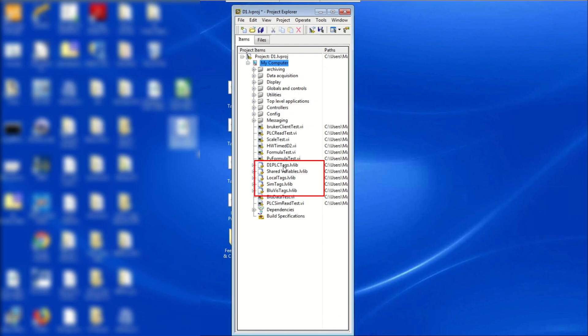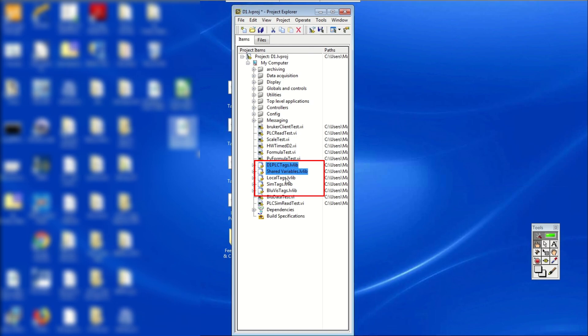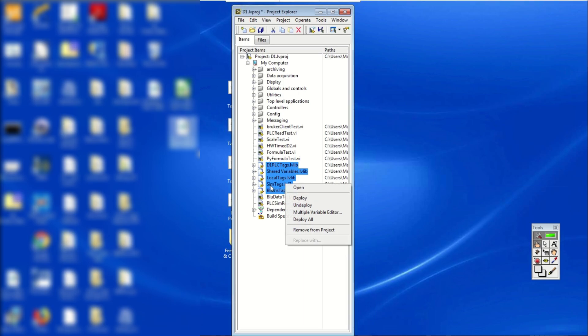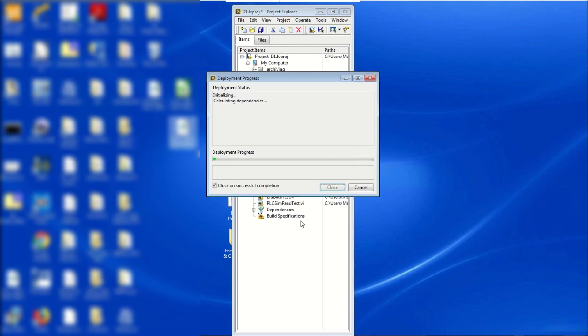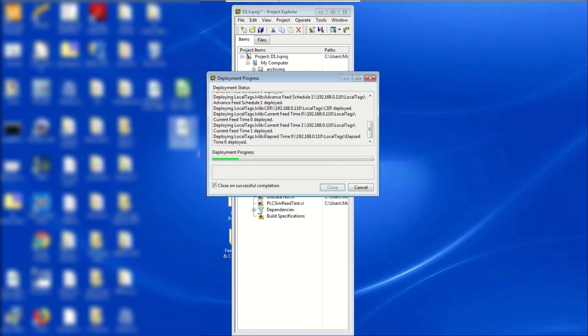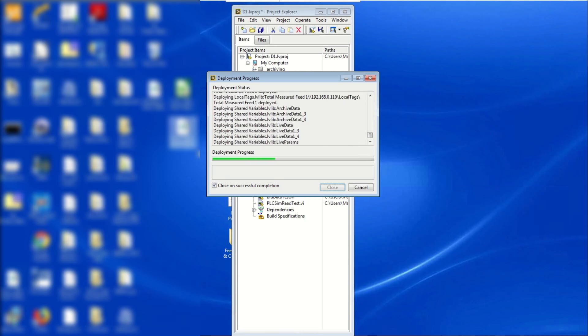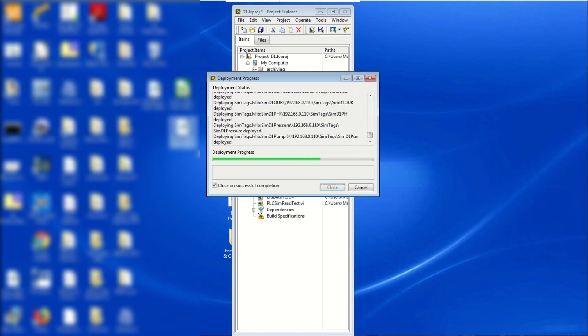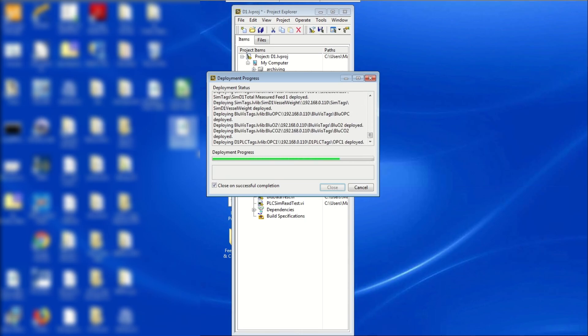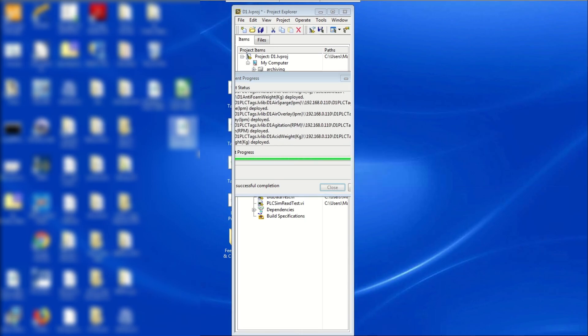To deploy all 5 files at the same time, hold the Control button on the keyboard and click each .lvlib file until all are highlighted. Then, let go of the Control key. Right-click on the highlight and click Deploy All. A deployment progress window will then appear. Once the deployment progress is complete for all 5 files, the window will close automatically.